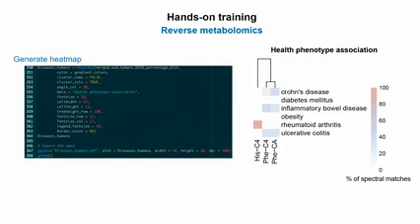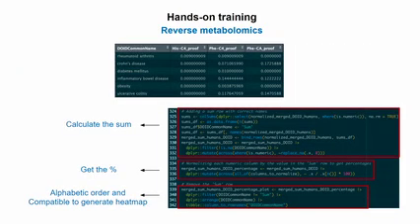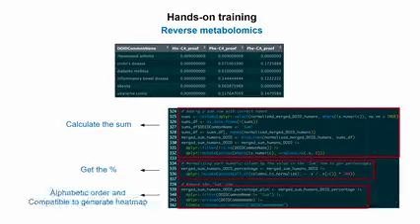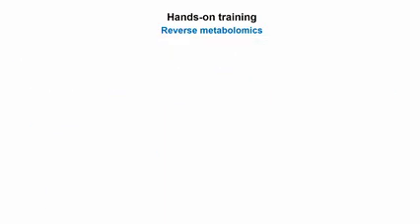I'm getting an error with one of the filter commands, that the delta mass is not found. Can you go and check that? I got the same error, and I don't know if the delta mass is supposed to be an object in R or... Here, the delta mass is actually just the column, right?